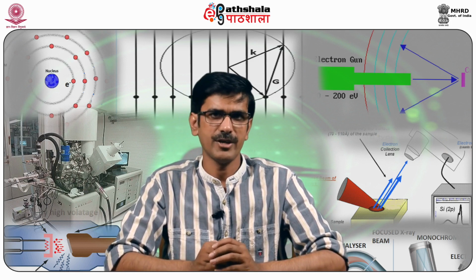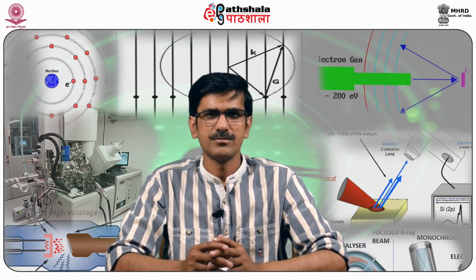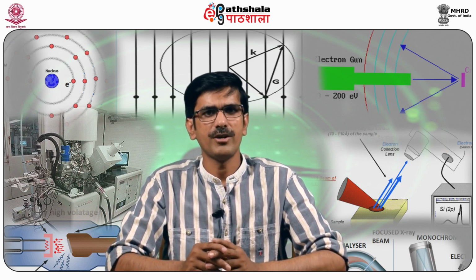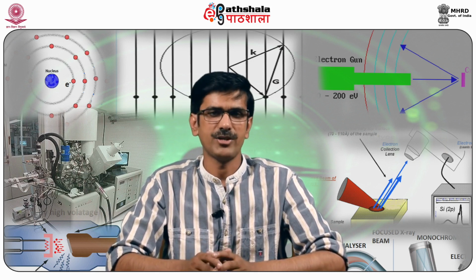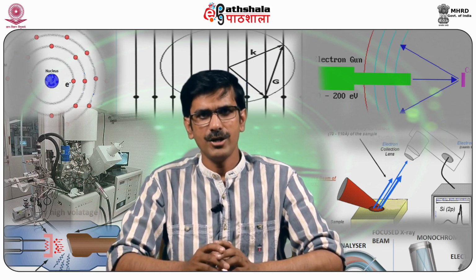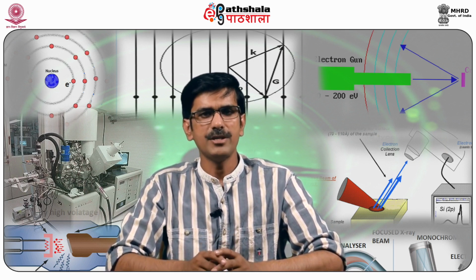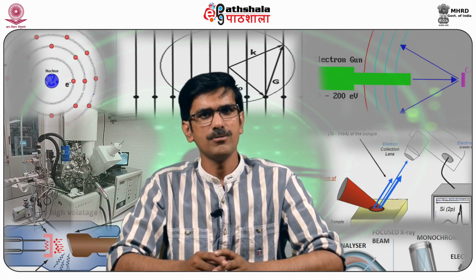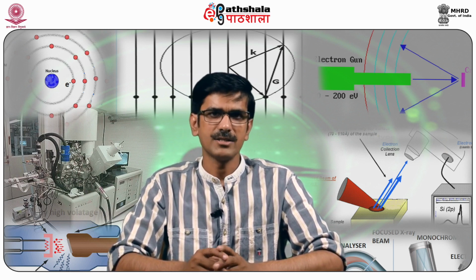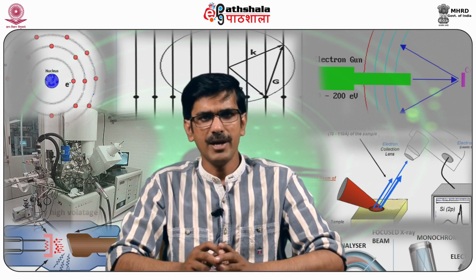Analysis of EDX, or energy dispersive X-ray analysis data. EDX is an analytical technique that is used for the analysis of an element or chemically characterizing a sample. This is a non-destructive technique and is useful for studying a range of materials. Elements whose atomic number is less than 11 are difficult to detect by energy dispersive X-ray analysis, as the silicon lithium detector is protected by a beryllium window.